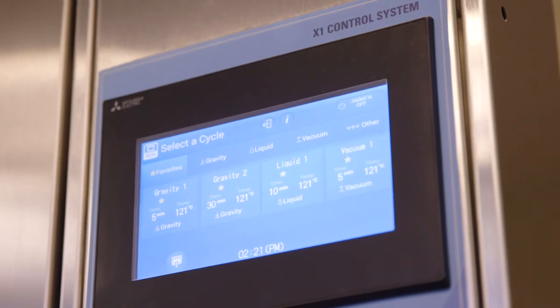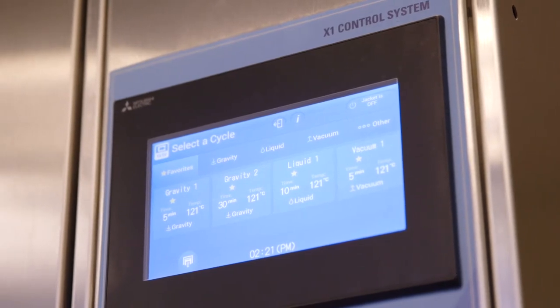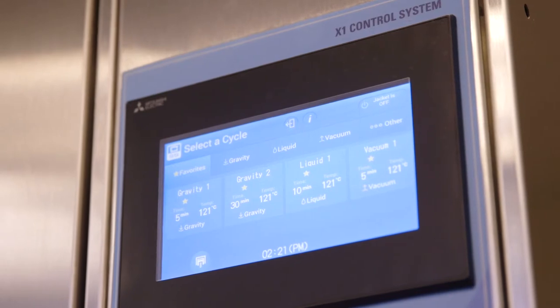The vertical sliding door autoclave features our easy-to-use, state-of-the-art X1 control system, which enables you to program up to 50 sterilization cycles and tag your favorite cycles for easy recall.